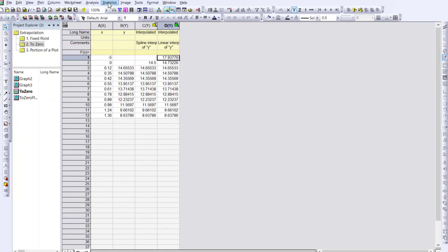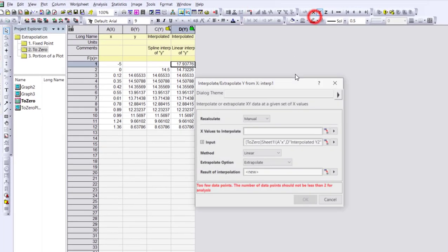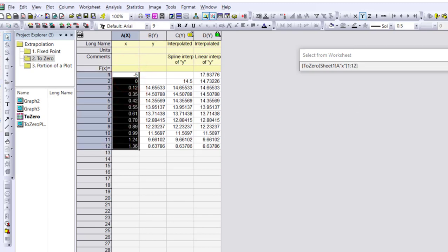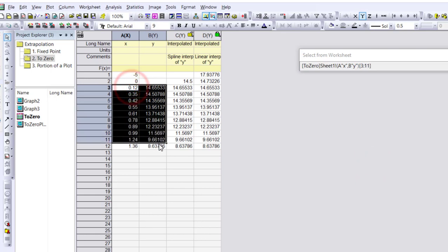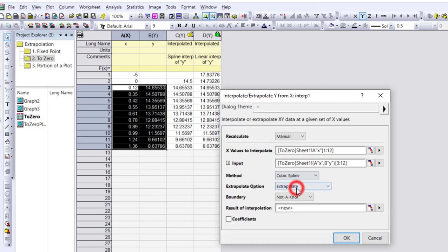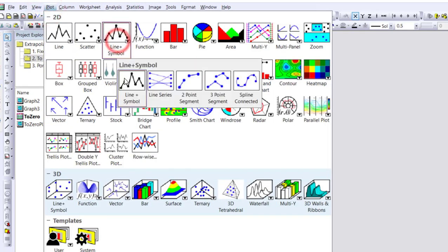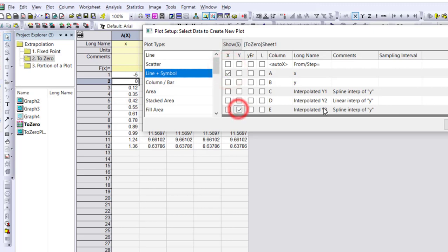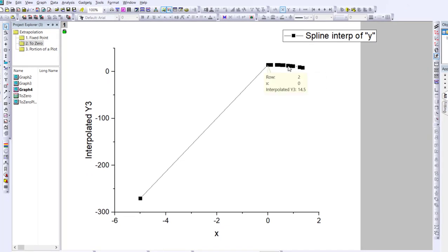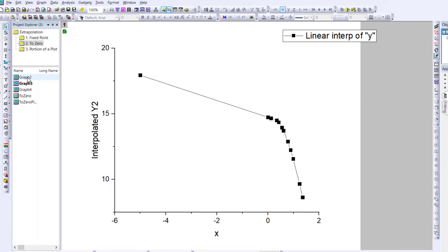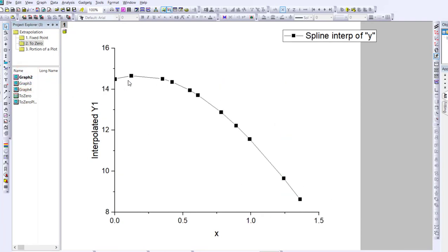Going back and choosing one of the cubic methods instead — which tells it to curve — gives a totally different value. This shows why it's really important to check the plots. The cubic fit still isn't perfect but it's definitely curving around. You have to be very careful with extrapolation: check that your plots are sensible, and be aware that it's very difficult to extrapolate well beyond your data set, especially when it's non-linear.